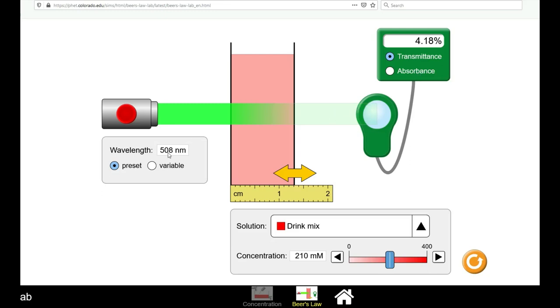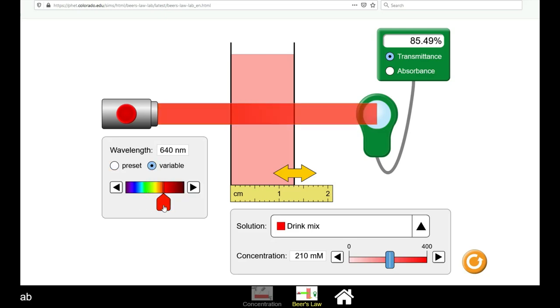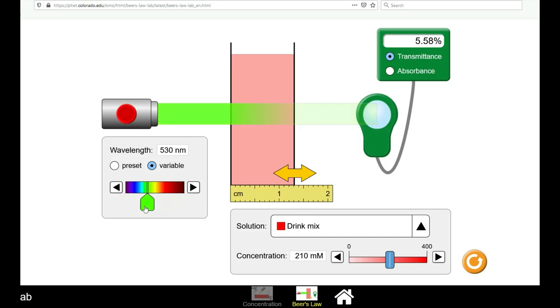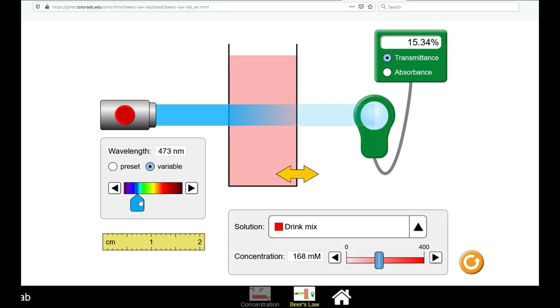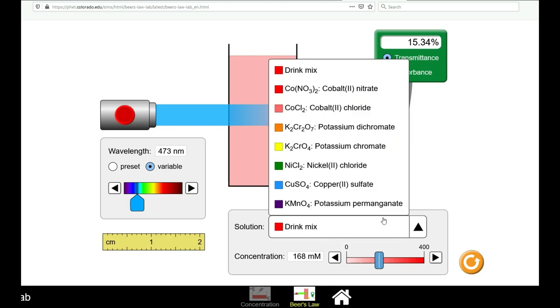You can also select the variable option and change the wavelength of light that is used to shine onto the sample. After you have varied the concentration, path length, and wavelength to see how these affect the transmittance and absorbance reading of the drink mix, you can select a compound of your choosing.